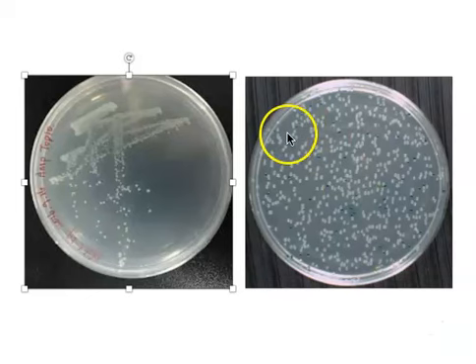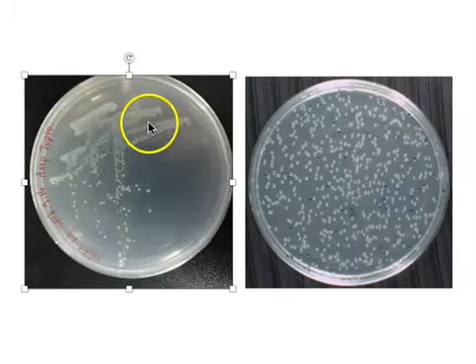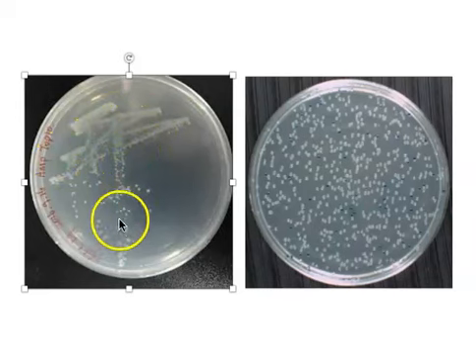Now, over here to the left, we have another agar plate, but this one is not a spread plate. This plate is called a quadrant streak plate. And this plate is made for a very different purpose. You can see that I've got bacterial growth on this plate, but in a lot of places it just looks like a big smear of growth. In other places on the plate, though, I can see these individual colonies growing.